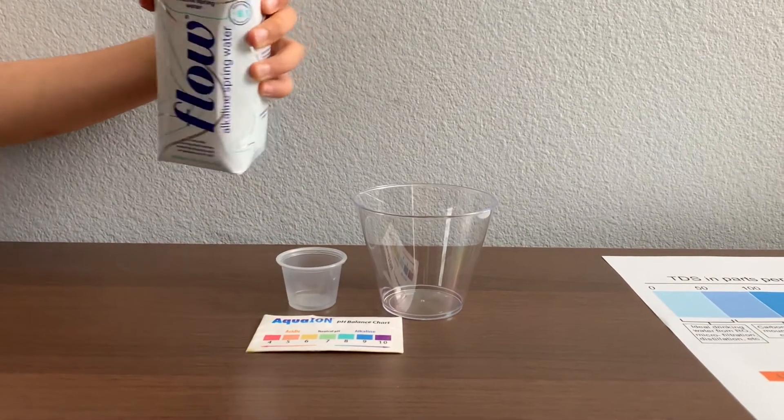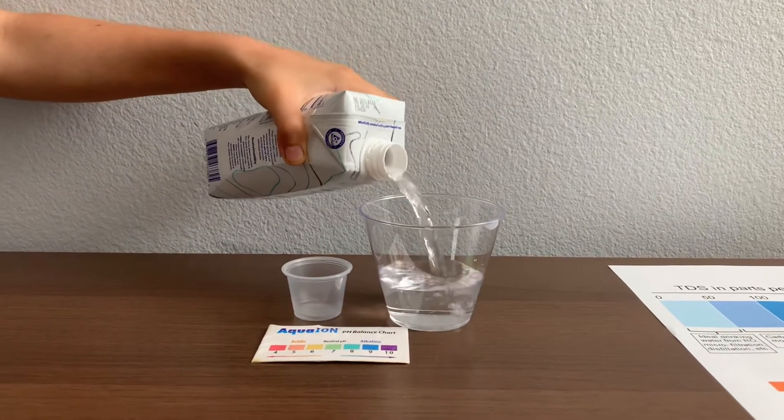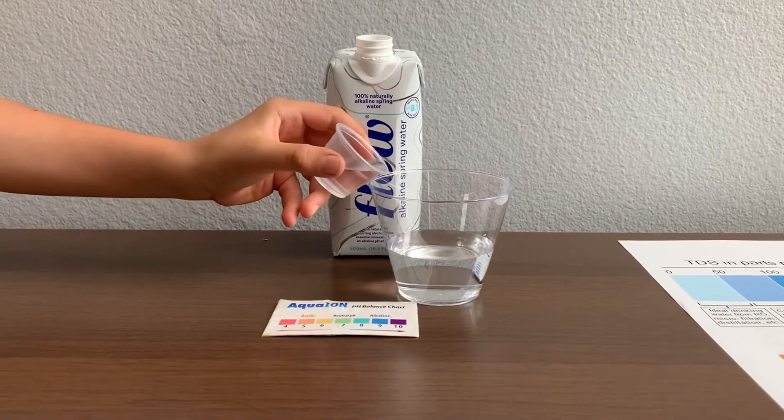Let's pour some water in. This is a little too much for the pH cup, so let's pour some back in for the TDS.